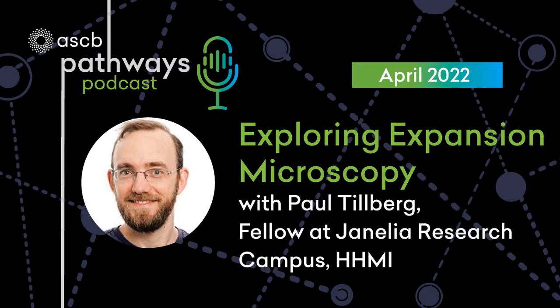Yeah. That's right. So the really important thing that controls the expansion factor is the crosslinker. If you don't have any crosslinker at all, you don't get a gel. You get polymer molecules that are floating around in solution, and they will dilute to whatever extent they have solution to dilute into. Now you start adding crosslinker to it, and those polymers link up into a network. And the more crosslinker you add, the more pulling force that network has. So you increase the crosslinker, you get less expansion. You decrease the crosslinker, you get more expansion.